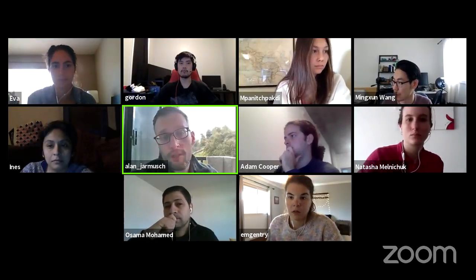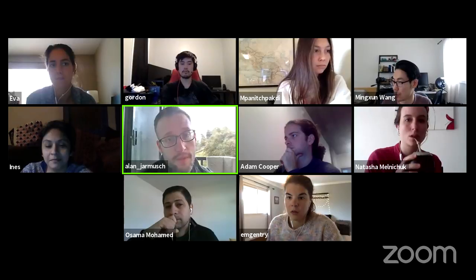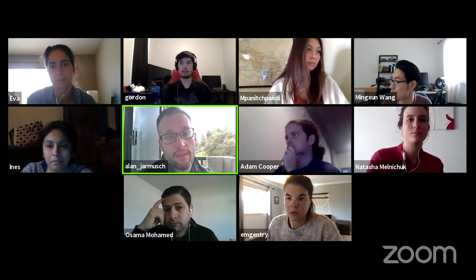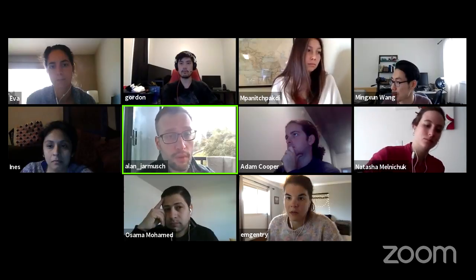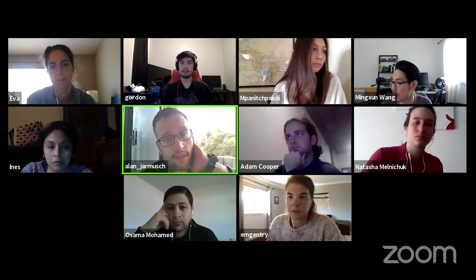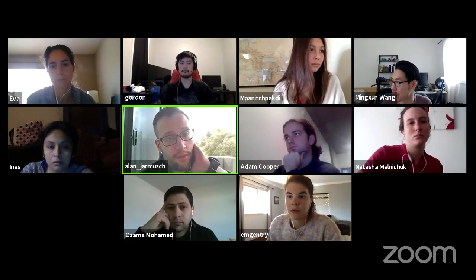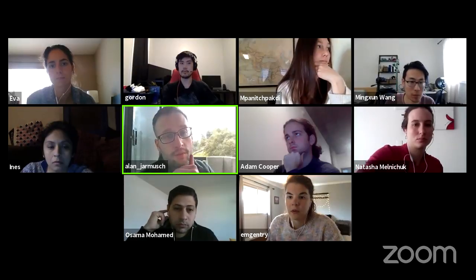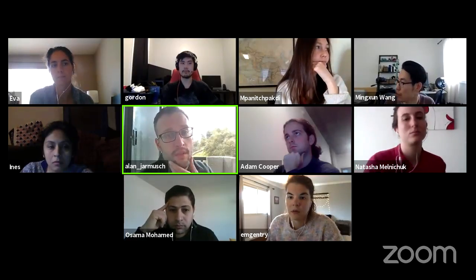Yeah, so I would suggest uploading both options. In the match report that you get in the results menu, it does in fact tell you the type of collision used and the type of instrument collected on. So it'll tell you that it's a CID match, or it'll tell you it's an HCD match.